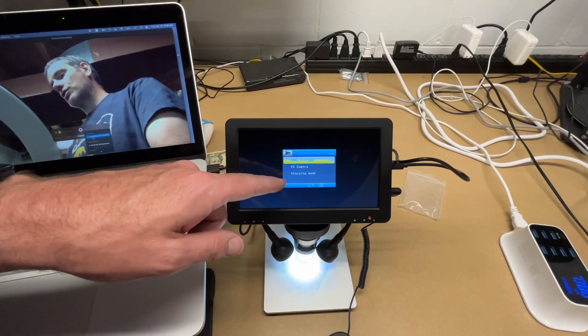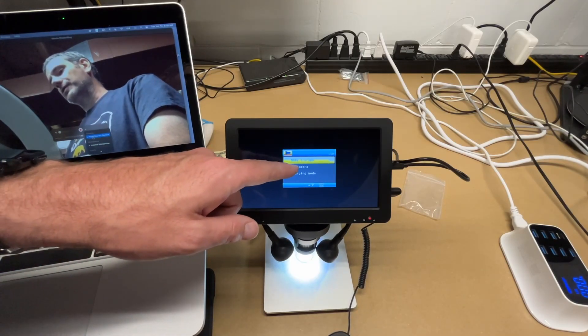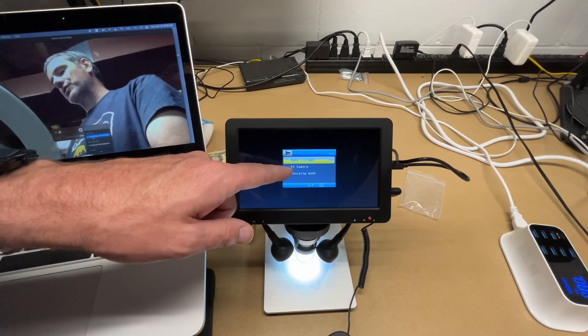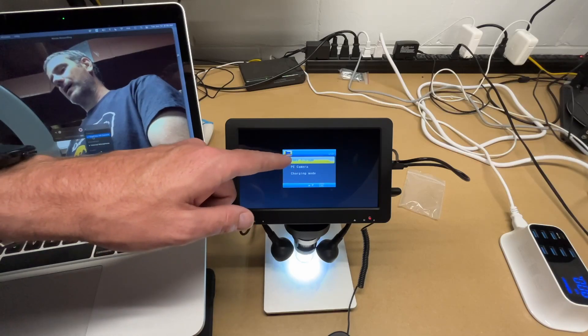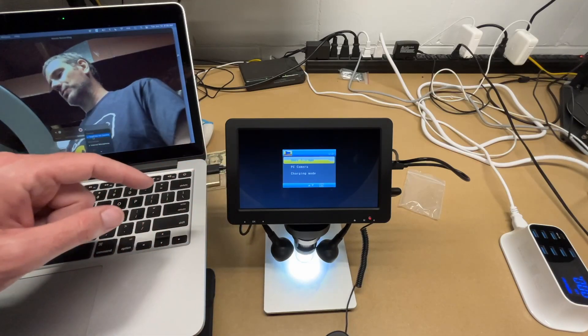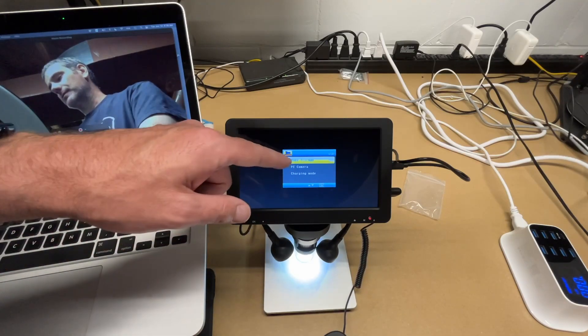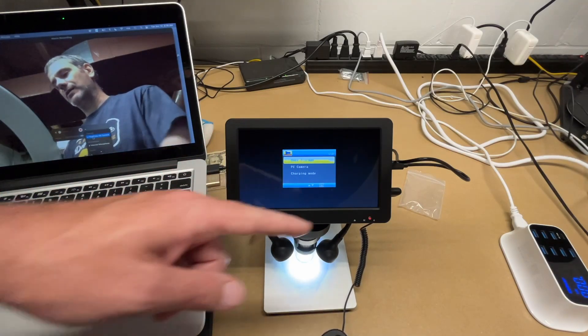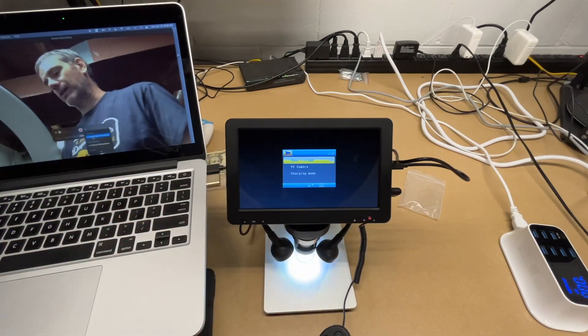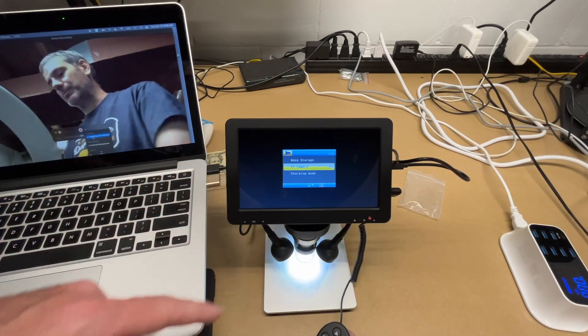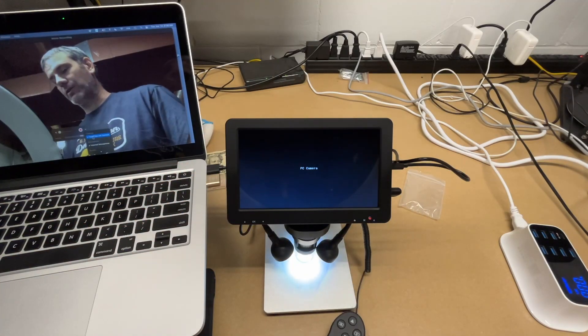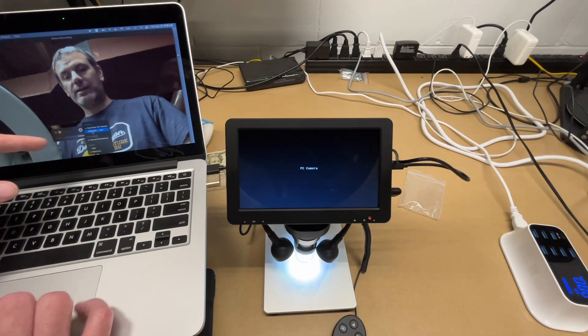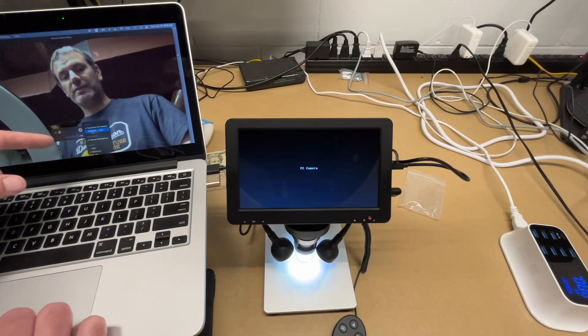It'll say mass storage, PC camera, or charging mode. So you can just have this charge on your computer. You can use PC camera, which turns it into a webcam or mass storage will allow you to mount the SD card to a computer to download the files, or you can just take the card out. So I'll switch this to PC camera. I'll hit okay. Then I'll go here. It says general UVC.